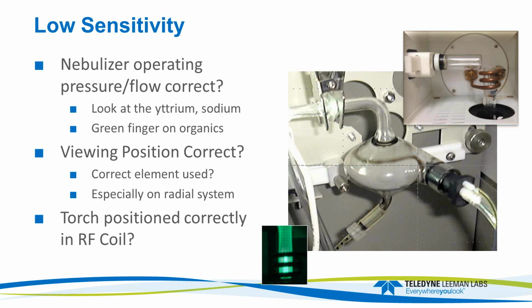Again, I look at the yttrium and the sodium. If I'm running organics, I look at that green finger. You can see that sort of down on the bottom there. See where that is. I'd like that to be somewhere right in that location, right in there.